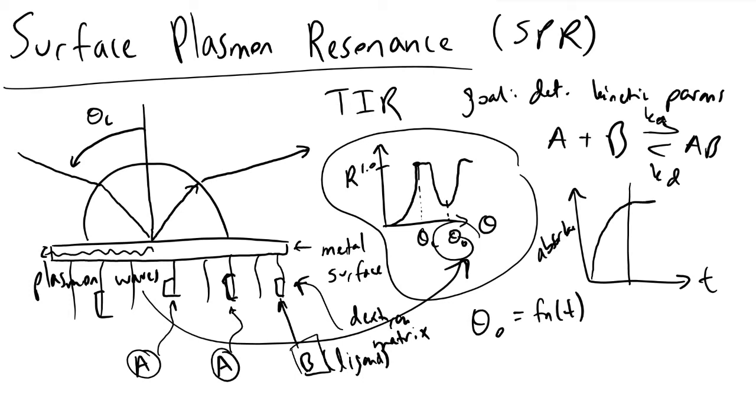Then we will realize some area in which we see linear behavior, and this is when we've reached equilibrium, which is pretty boring. And then we will enter a third regime in which we see dissociation. From the initial regime here, we can evaluate with some math equations what Ka would be. From the linear regime here, we would be able to calculate what Keq is. And from this third regime, we can calculate our kinetic parameter little kd.